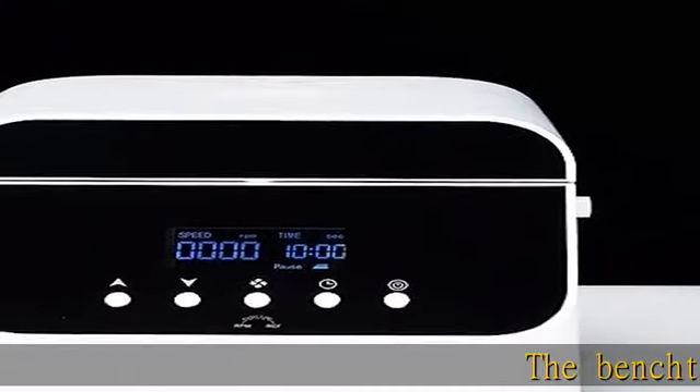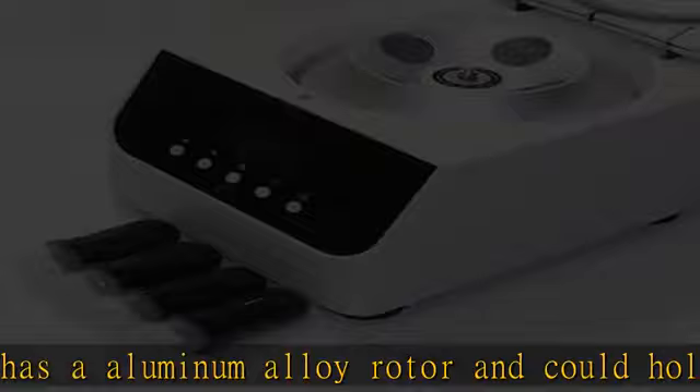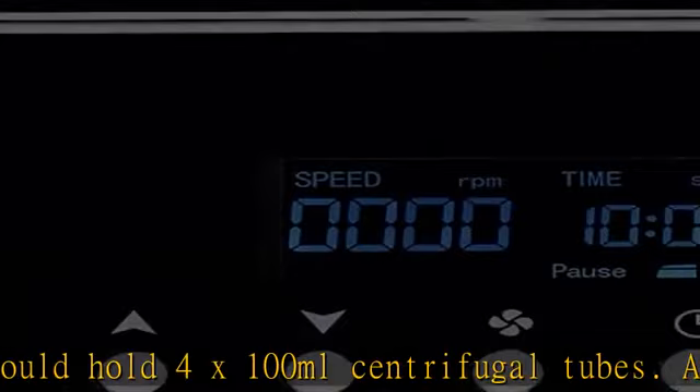The benchtop centrifuge has an aluminum alloy rotor and can hold 4x100ml centrifugal tubes. ABS housing is high quality and durable. The large LCD display shows clear speed and time, simple and convenient to use and operate. It can be timed and the relative centrifuge force can be switched.